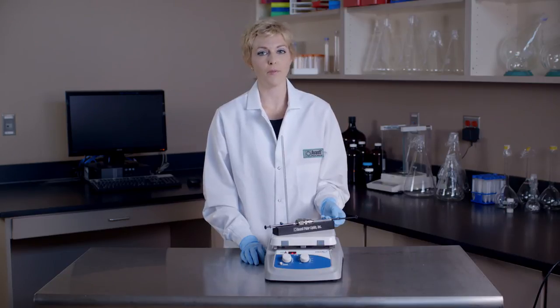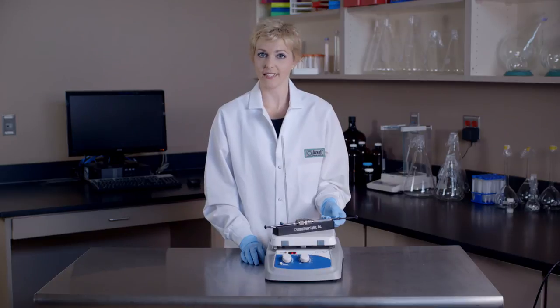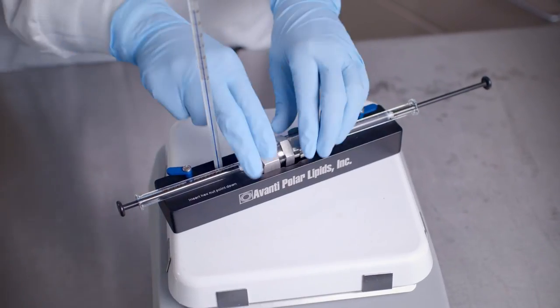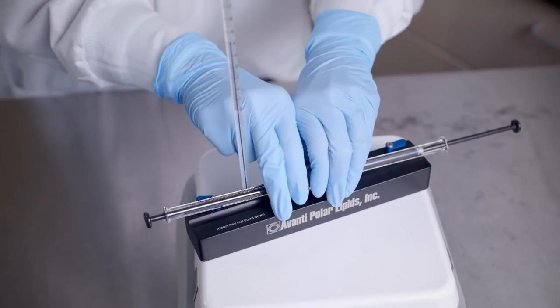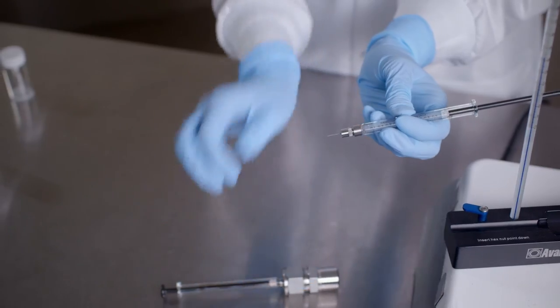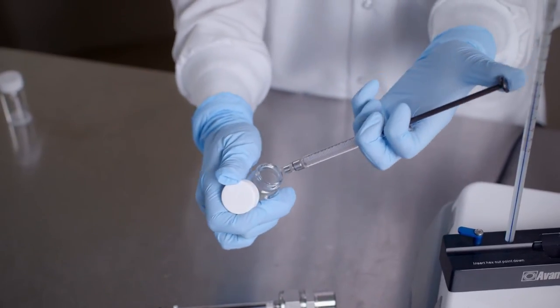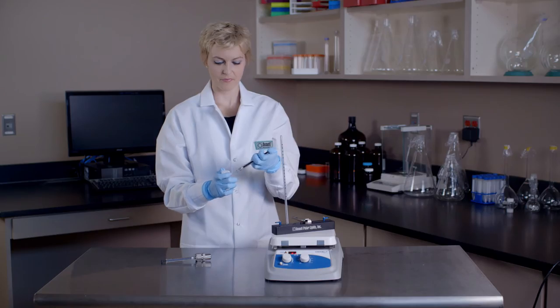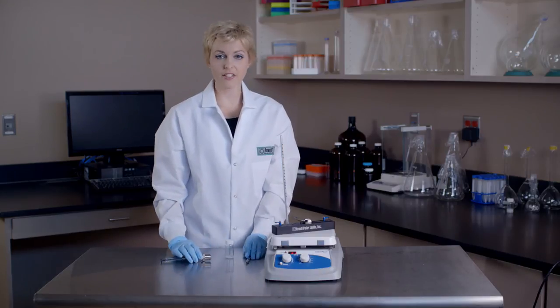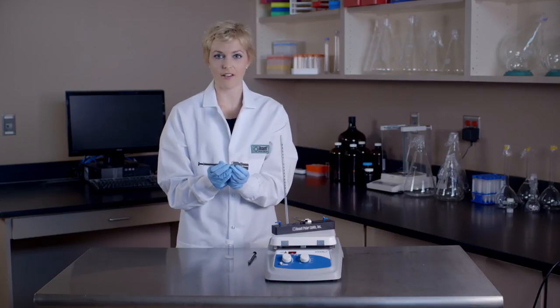These large particles may be removed by centrifugation to get a clear suspension of SUVs. After the final extrusion, remove the extruder from the heating block. Remove the filled syringe and inject the lipid solution into a clean sample vial. As a very important note, when removing the syringes, be sure to pull them straight out of the mini extruder. Removing them at an angle could induce cracking of the syringes.